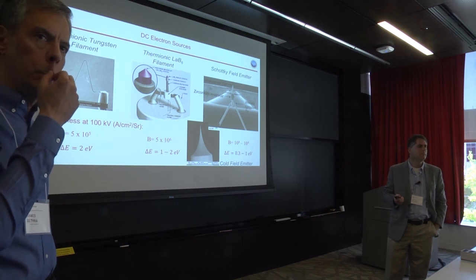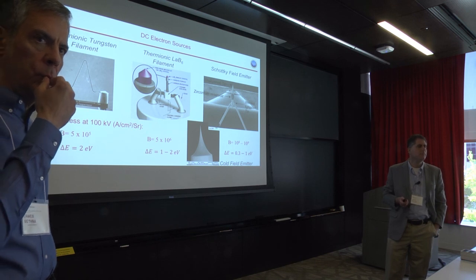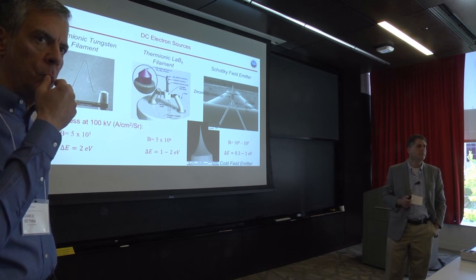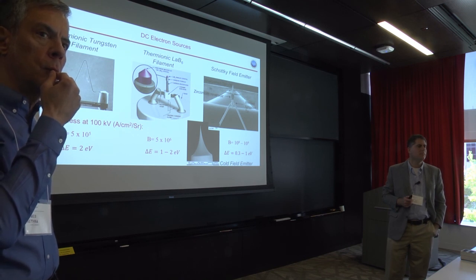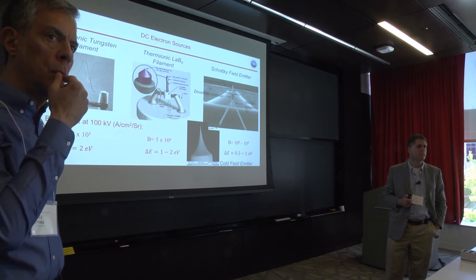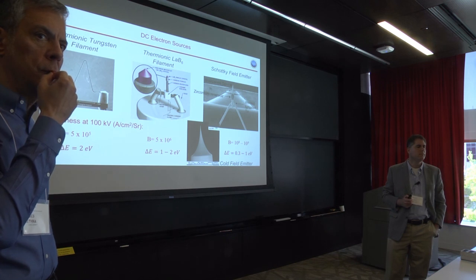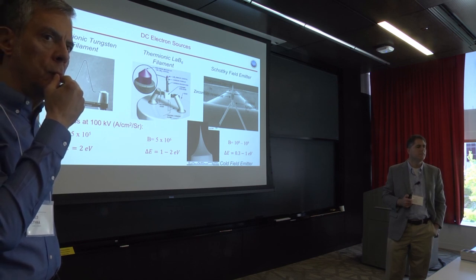if you immerse a cathode in a very strong magnetic field, let's say a few kilogauss, then the Boersch effect is suppressed, and it has been known for a while. You can also suppress the density fluctuation effect, which transfers into longitudinal temperature. So basically, there has been a lot of work in the field of electron cooling to suppress the longitudinal energy spread down below thermal limits.